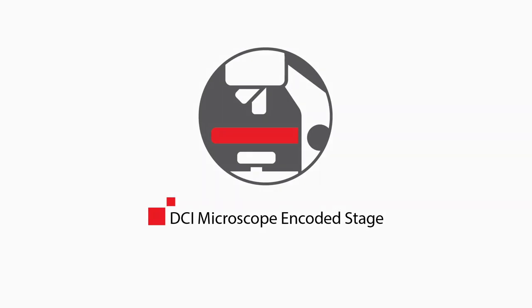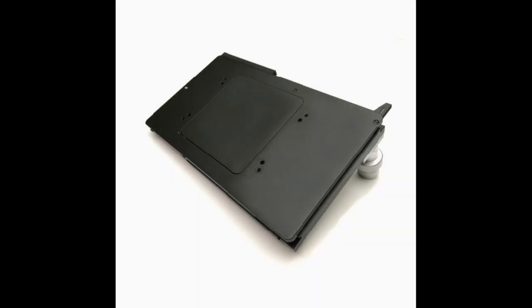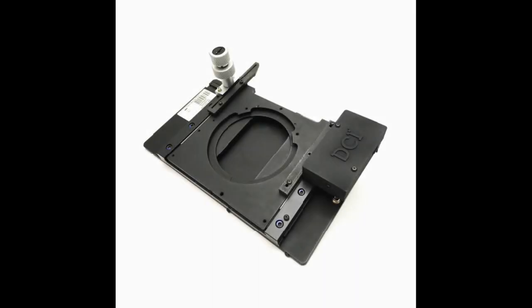This video is to present the new DCI microscopy encoded microscope stage. DCI's encoded stage allows to build mosaic images of hundreds of fields in a matter of minutes.